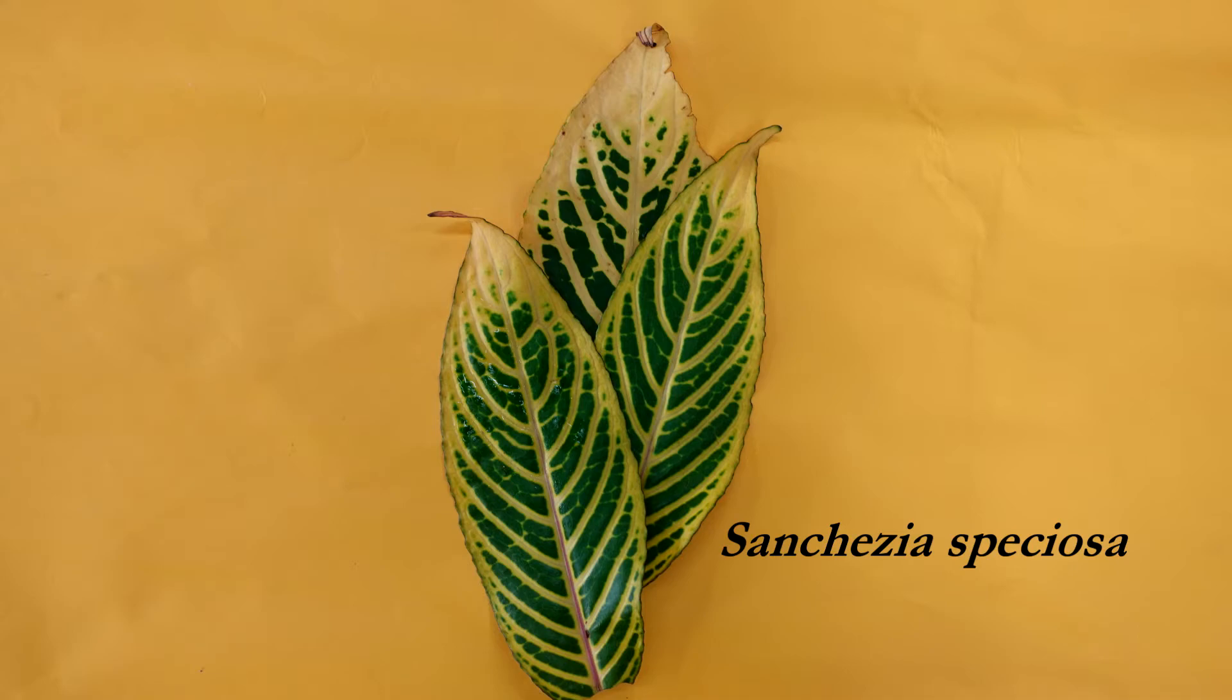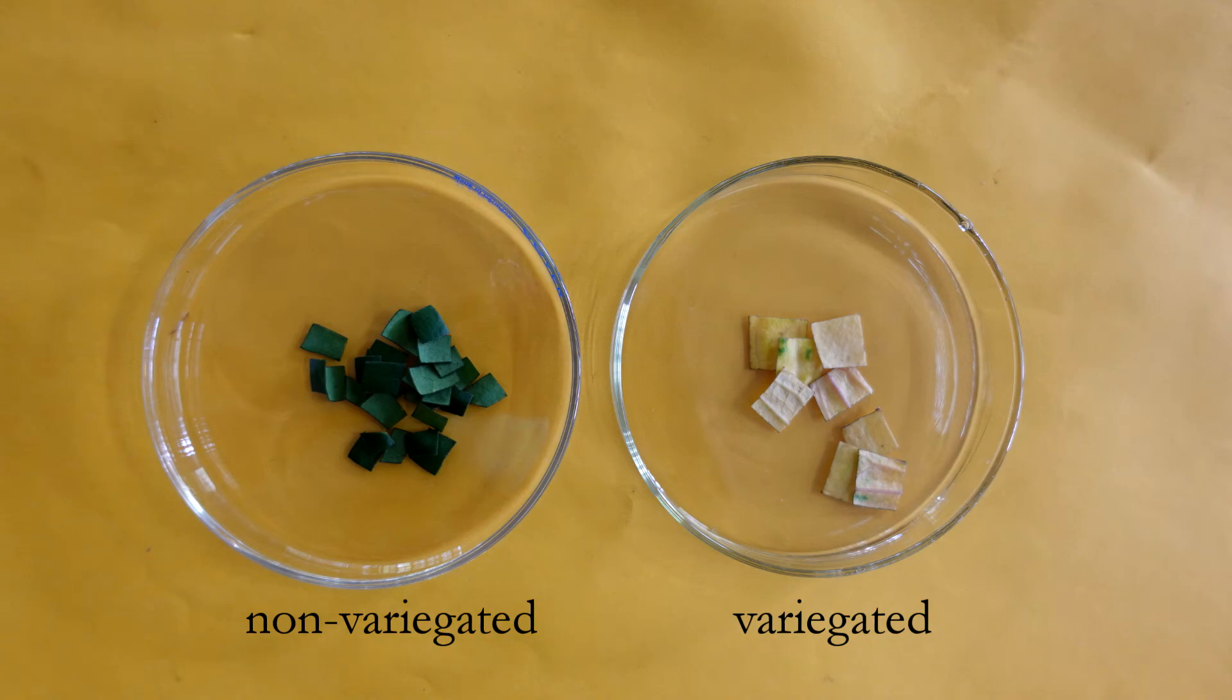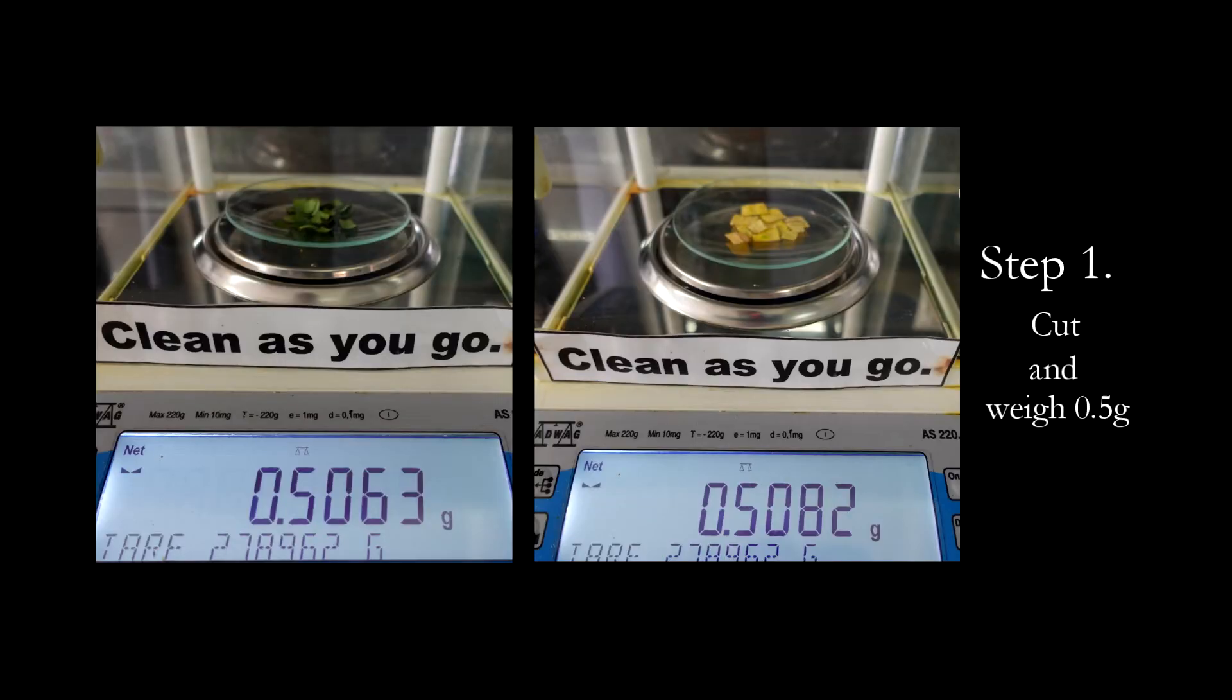In this part of the experiment, we will be using the leaves of Sanchezia speciosa. As you can see, its leaves are variegated and we will be performing the same procedure as before, but this time we will separate the variegated and non-variegated regions of its leaves.